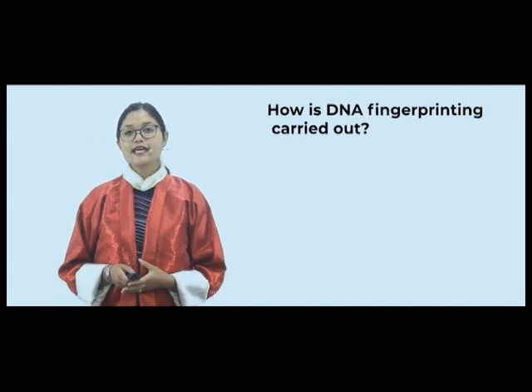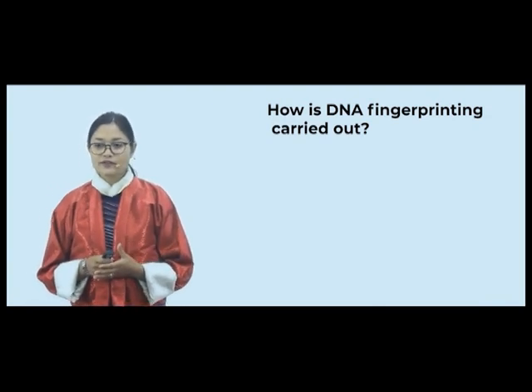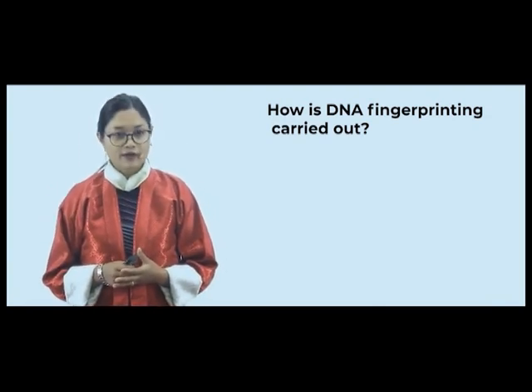Okay, now having understood some of the principles of our DNA, the makeup of the DNA that makes us look different, we should also understand some of the procedures that are carried out in the technique of DNA fingerprinting. Now, to understand the procedure, first of all, DNA fingerprinting is carried out in a laboratory.